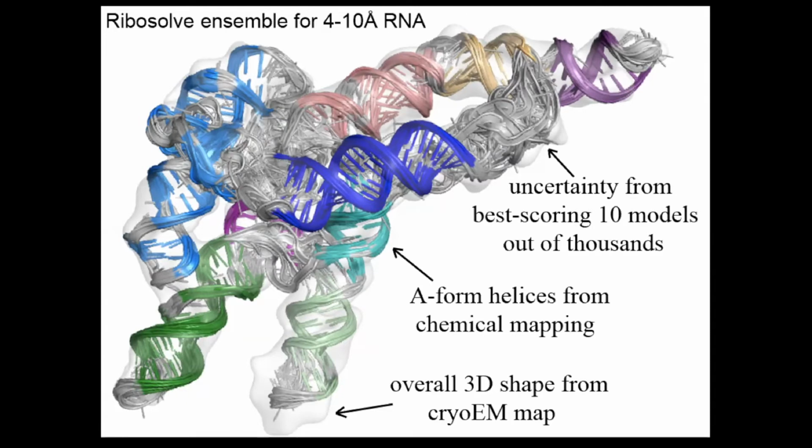It's very good for the end user, but it's also pretty good to keep the structural biologist honest about what inferences you actually can make. And so these pictures work very well. Nobody has really developed a good way of showing enough uncertainty, but not too much at 3 to 4 angstroms, but we'll get there.